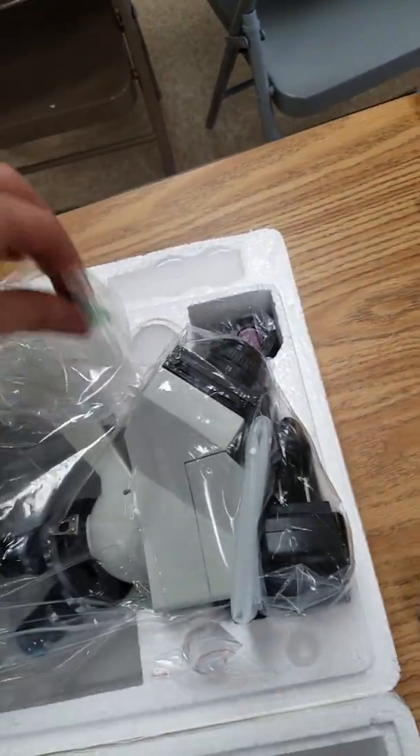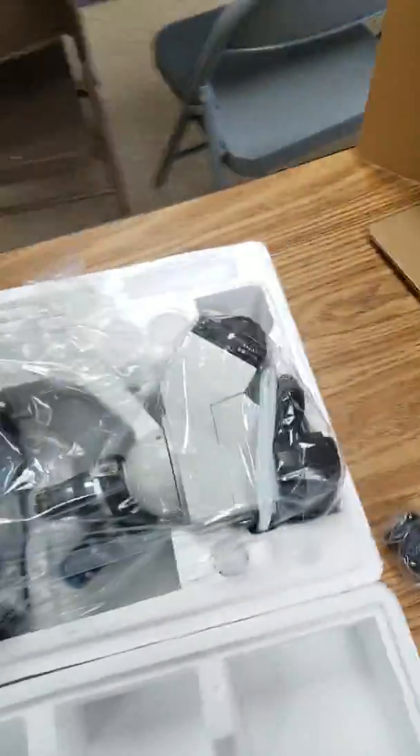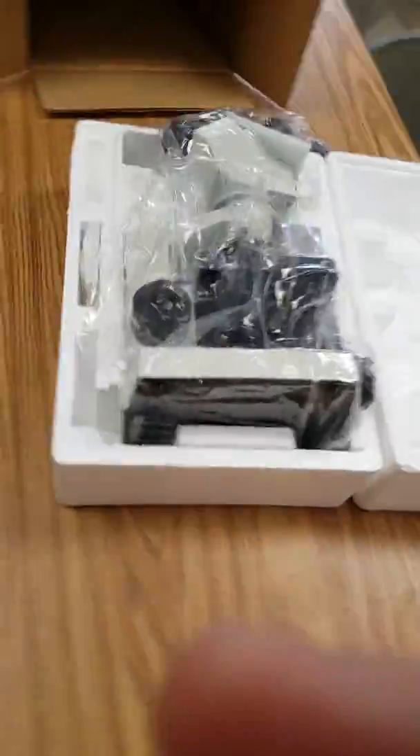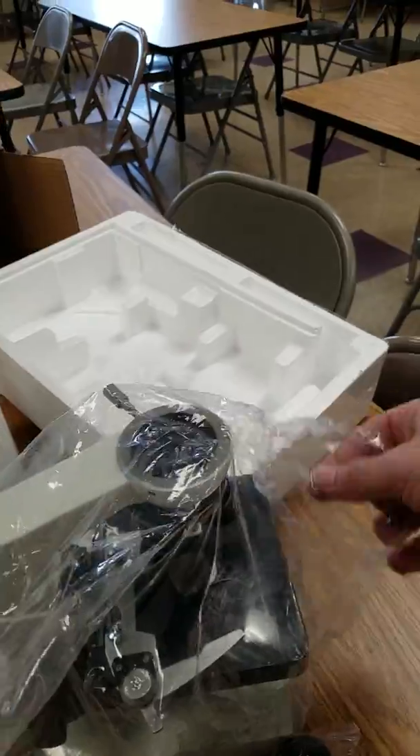So we have different options for ocular lenses — either 10 or 20 times zoom. Not sure what that is, and just some more garbage. Let's pull her out. Beautiful, just beautiful. But not if I break it as soon as I bought it — I'm going to set this up right.